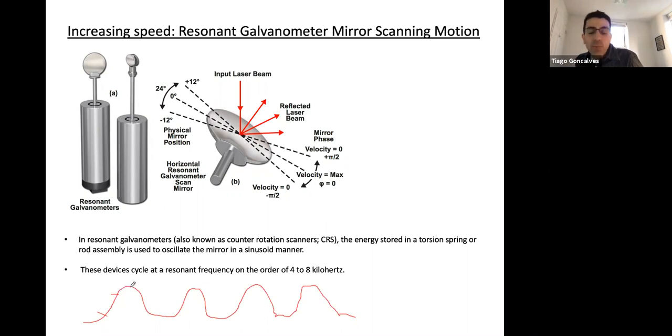you start getting to this point, your mirrors start moving really, really slow. And remember, usually you're pumping a lot of power in here because your dwell time in every pixel is very short. And suddenly they almost grind to a halt and then they start going back. But the problem is you're applying a lot of power at the edges of your image.